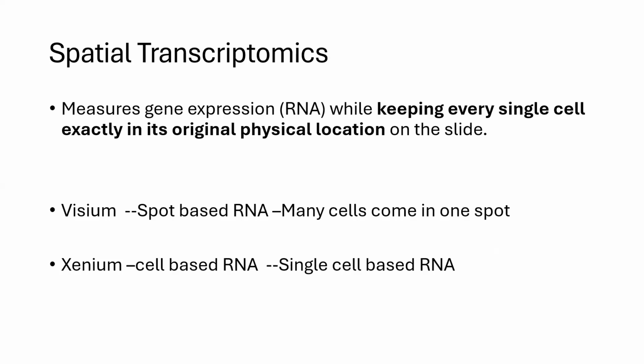So instead, from a biopsy itself, if a translational researcher can understand what the genetic expression or the RNA count should be, that is tricky. That is called spatial transcriptomics. There are two methods: Visium, which is spot-based, and Xenium, which is cell-based. Xenium is costlier. In Visium, many cells share one spot, so the expression may be less. In Xenium, a single cell gets the RNA sequence.